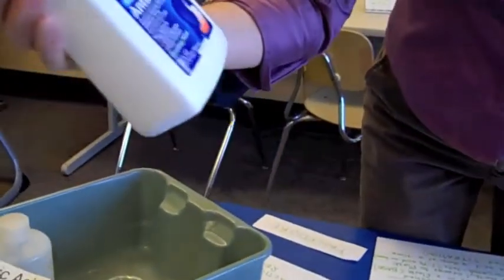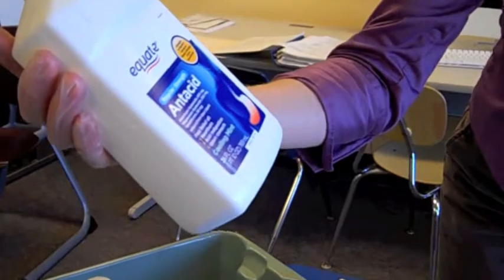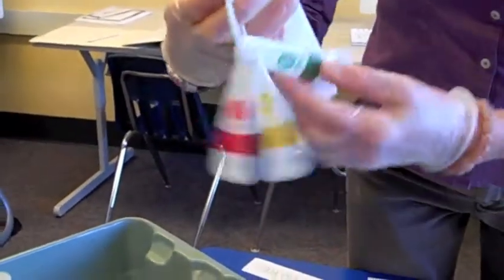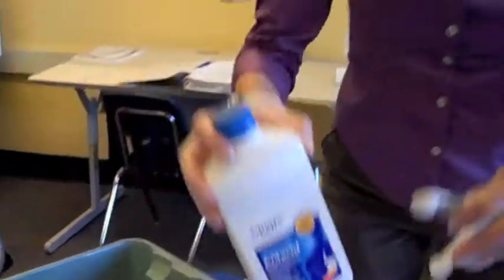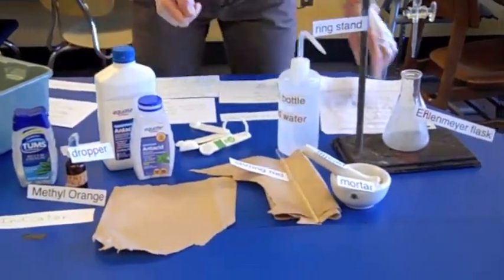And the third thing you're going to test is this powder. Oh, it's a liquid. And for that you're only going to use half a teaspoon, because that would be half of the lowest dose they recommend. Thank you. So I've taken my Tums, I've crushed it in the mortar and pestle.